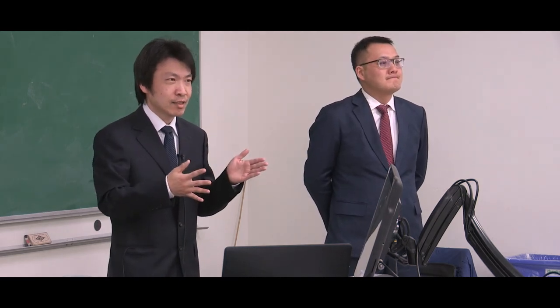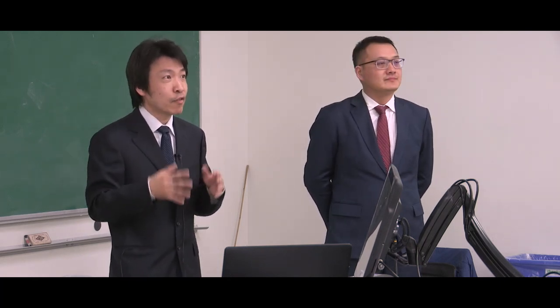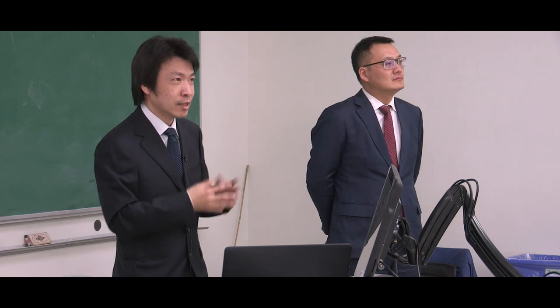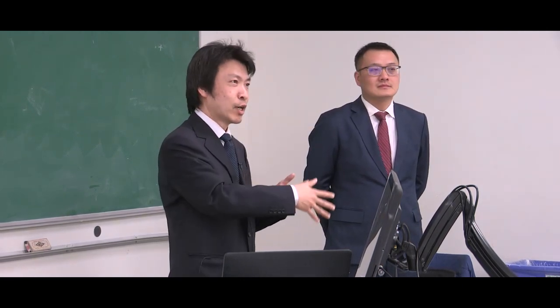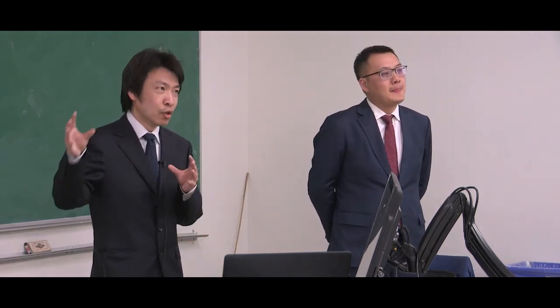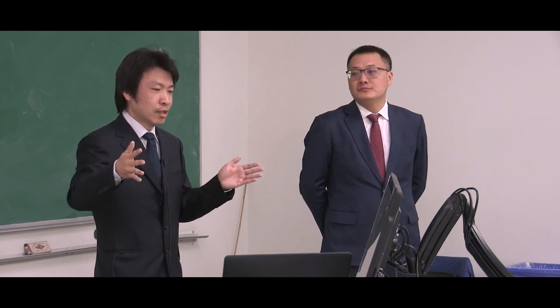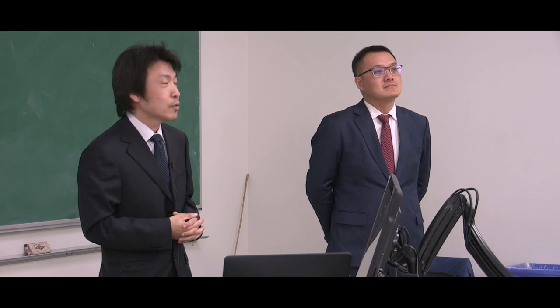And the chip design is just a preliminary idea that we put into this study. There's definitely room to further optimize the chip design, right? This can be done fairly quickly, because you basically just modify the design on the computer and print another device onto the filter paper. With that, we think there is potential to further lower the cost for each test. And I think there's no limit to increasing the throughput. You can put many, many parallel channels on the same device, as opposed to other methods that we are comparing to.